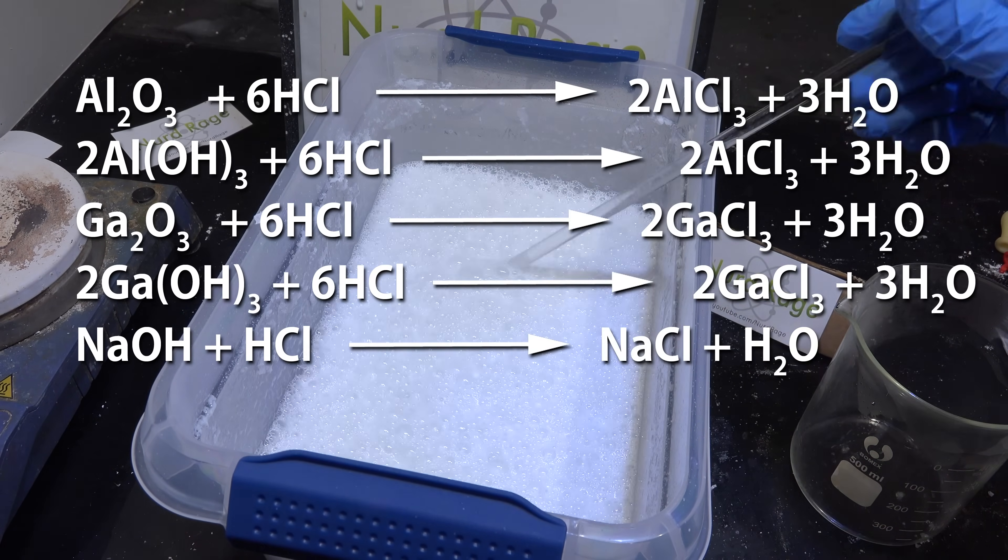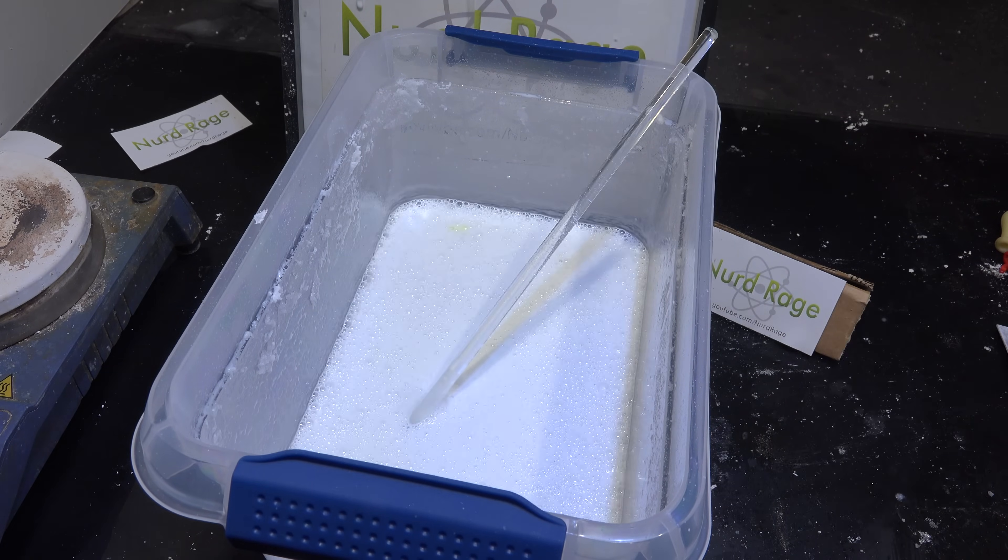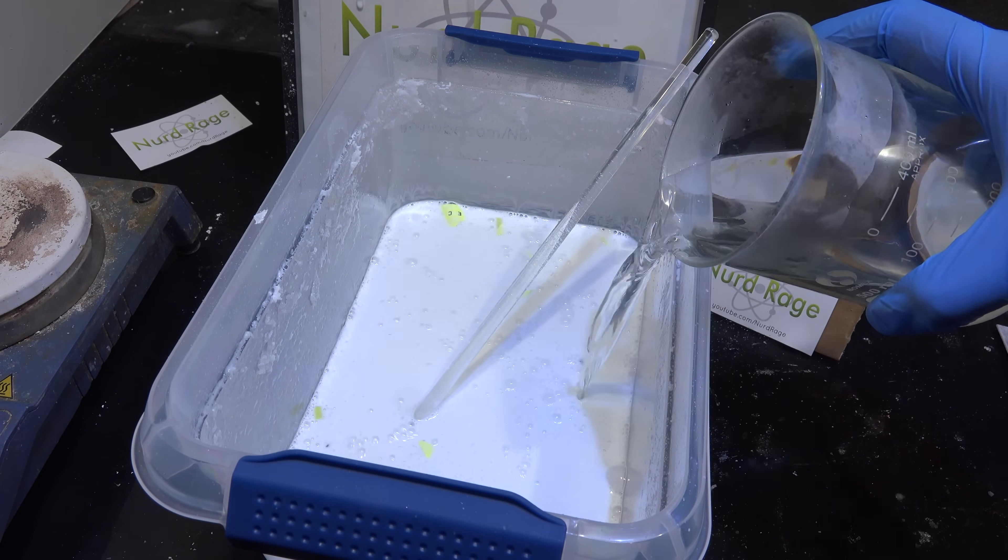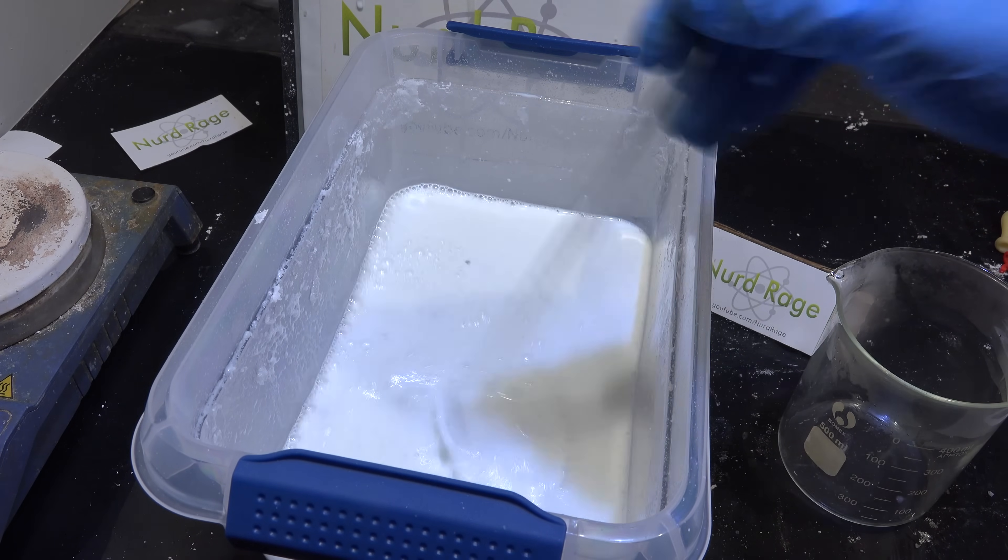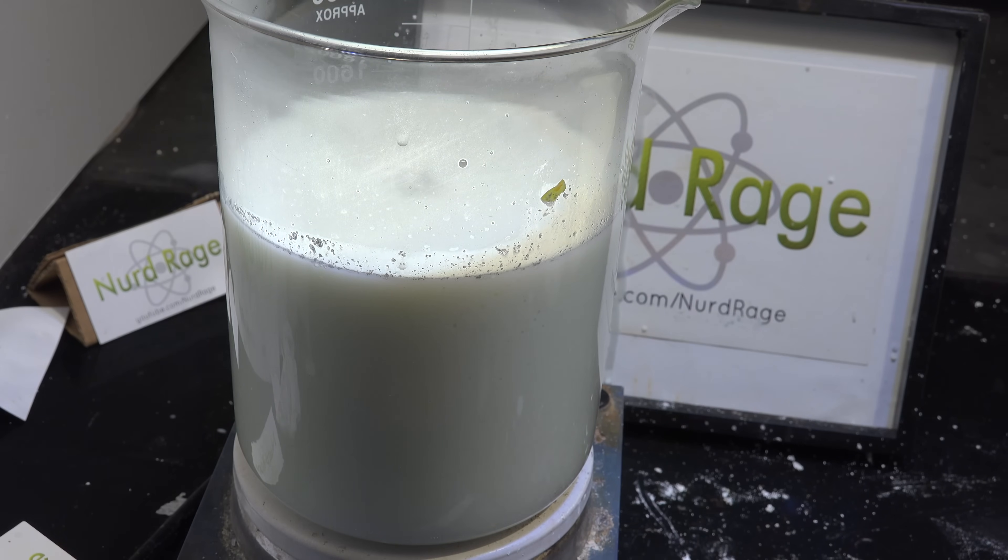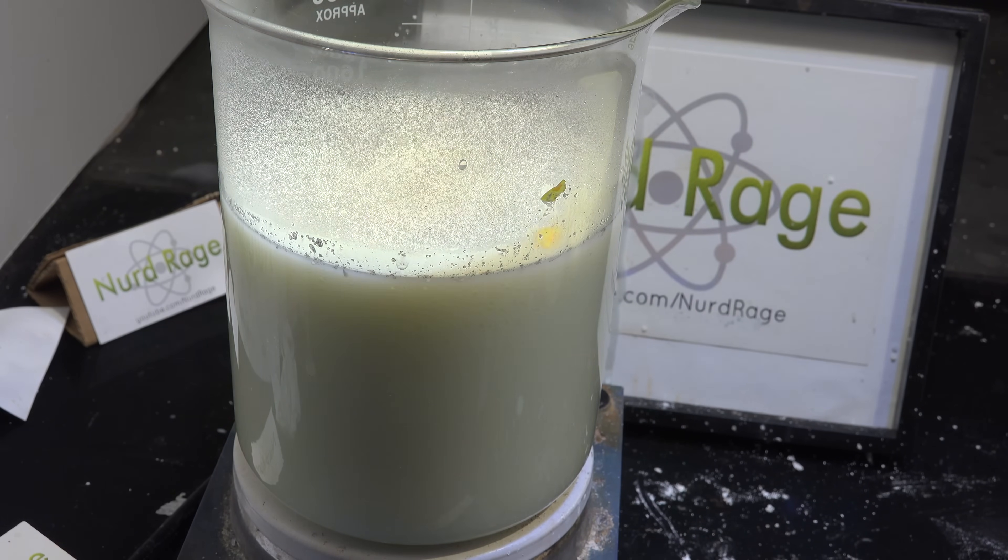What we want is to convert all the metal oxides and hydroxides into their chloride salts: aluminum, gallium and sodium chloride. Keep adding hydrochloric acid until it stops bubbling. It's not clear yet because at room temperature the conversion to aluminum and gallium chloride is rather slow. Transfer the mixture to a glass container and heat it on the hot plate. As it heats up it will drive the reaction forward and clear up.